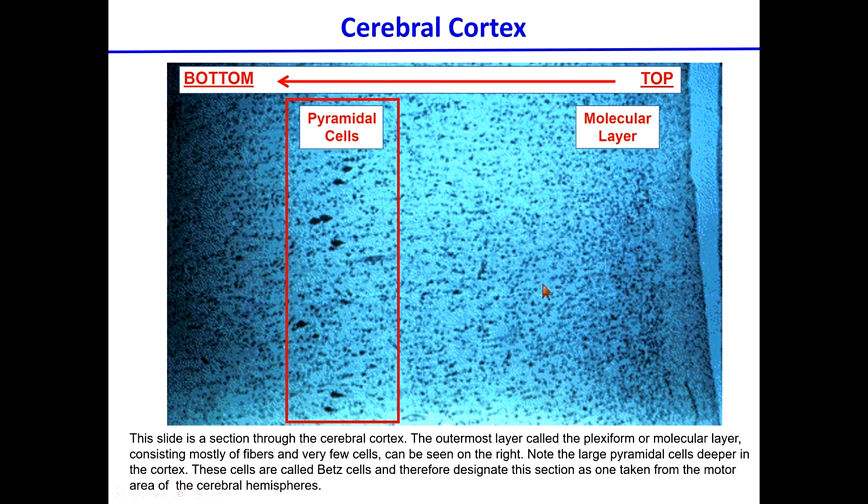The way this looks will again depend on the type of staining that you have. So this is the molecular layer, and then it becomes more cellularized. And the way this doesn't stain that much is because the axons did not get stained. Questions?